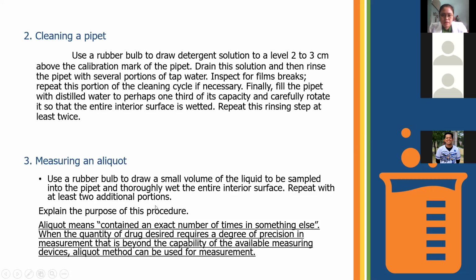The liquids in the lab can be infectious, toxic, harmful, and if magka-aksidenta sa lab, like mahulog and magyabo ang liquids, magka-infectious gid, and kailangan nato siya i-clean og water para mawala. Most of these liquids are transferred using a pipette, so we need to regularly clean a pipette tube.